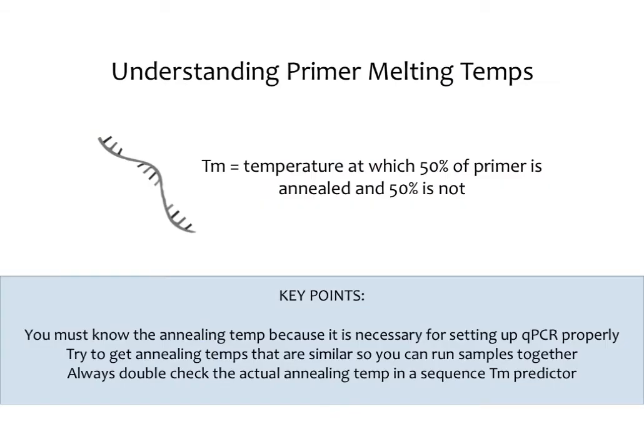So now we've done that reaction and we have the cDNA that we need. So now we're on to doing the actual qPCR. And there are some considerations that are going to go into that qPCR, right? Because the 2 big things we need are cDNA, and then we also need primers. And then, of course, we need SYBR and water, but those are things we're buying. So we're buying this, we've made this.